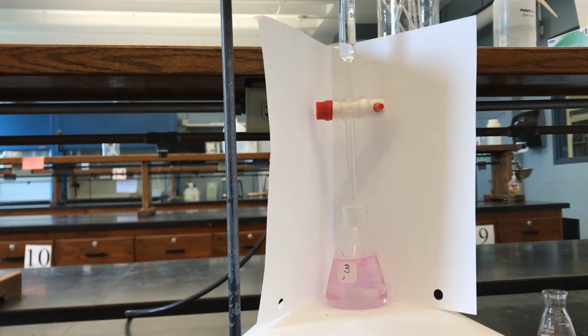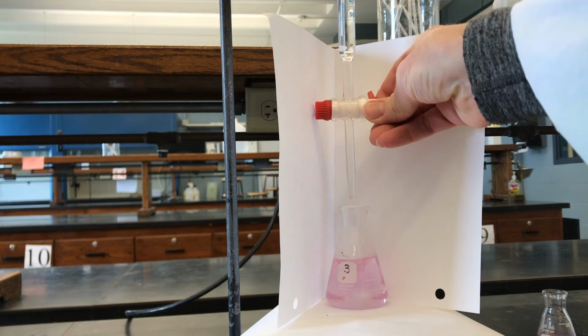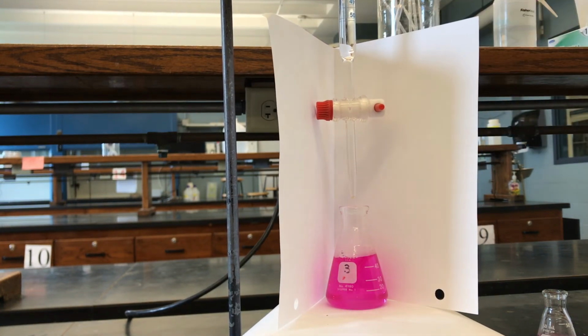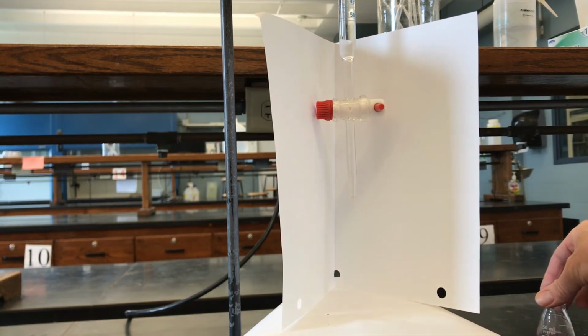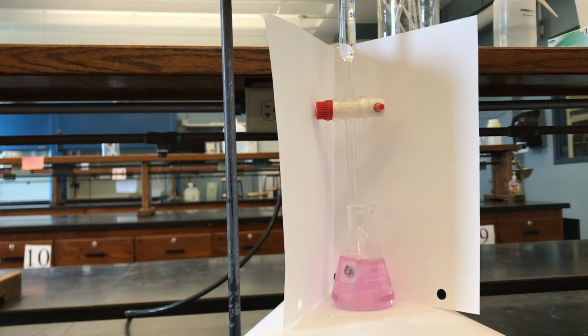And just while I was taking that picture, this is already faded back. This is trial 3. It's already faded back to a very pale pink. So I'll just show you what happens if you way overshoot the endpoint. You get that color, which is pretty bright, kind of a fuchsia. That's adding way too much. That's not the color you're looking for. Again, something closer to this is a good color for the end of a titration.